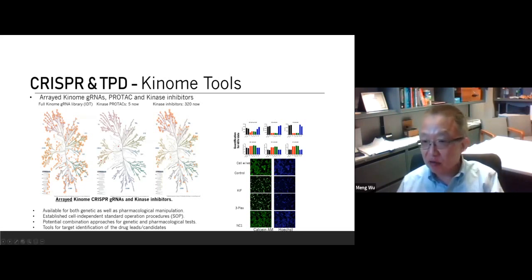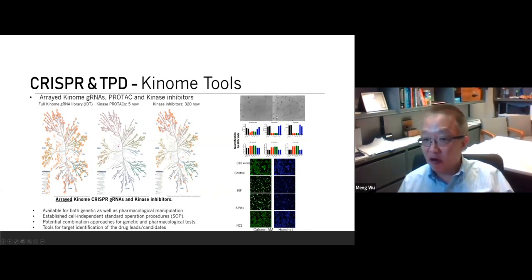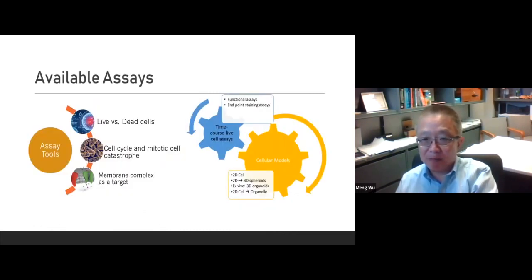You can see on the right side, we have already done something with different assays to detect them as well. And the last part can show the different morphology. We do both high content as well as high throughput. That's the second library I want to mention.